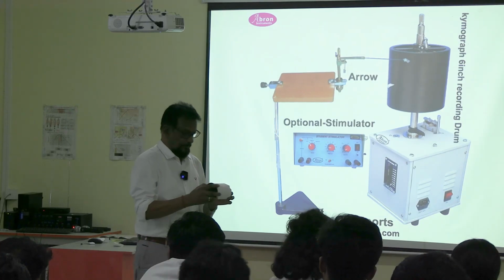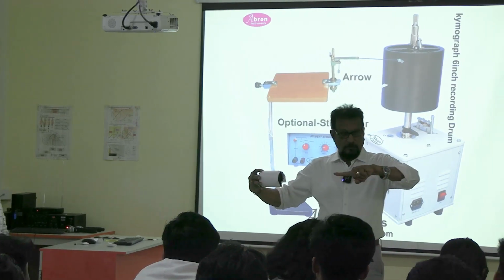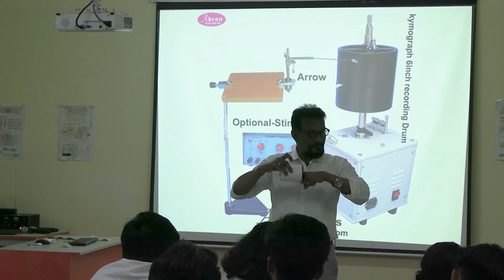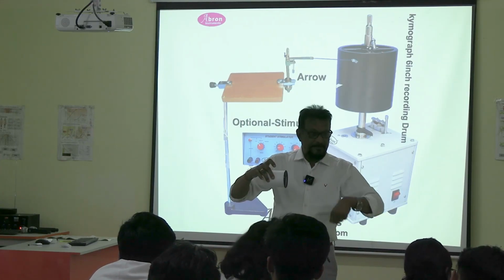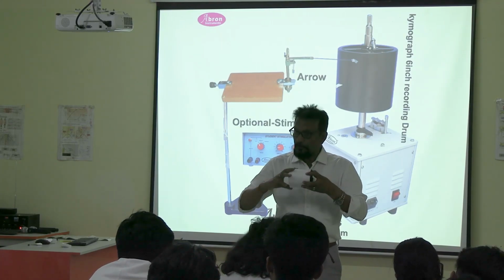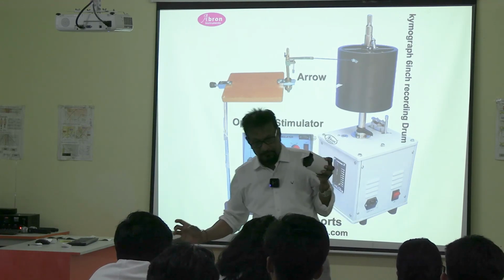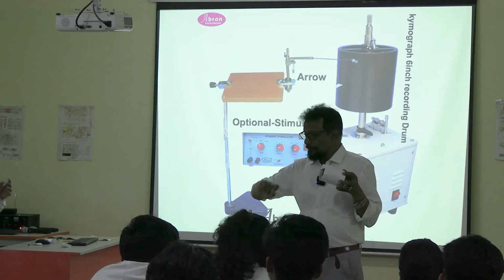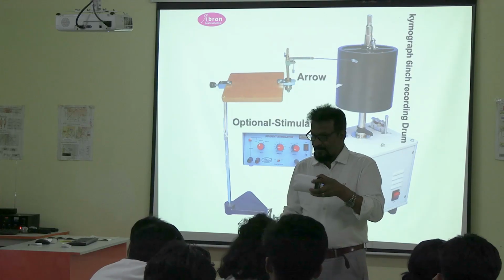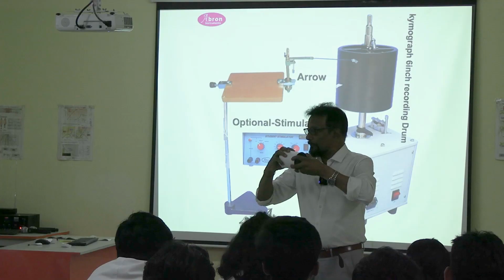How can you smoke? There is another device, another rod-like device. You can insert it into the rod. And there is another handle. If you move this handle, it will be rotating. Then you do one thing. There is a kerosene lamp. So fire it. It will produce smoke. So with this kerosene lamp, in one hand you just keep it moving.